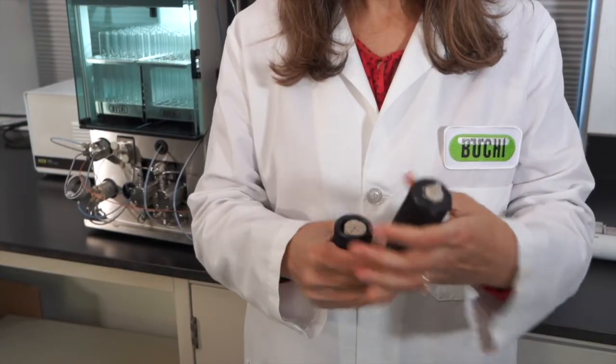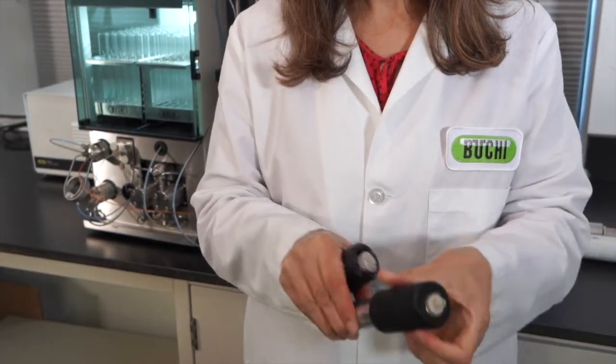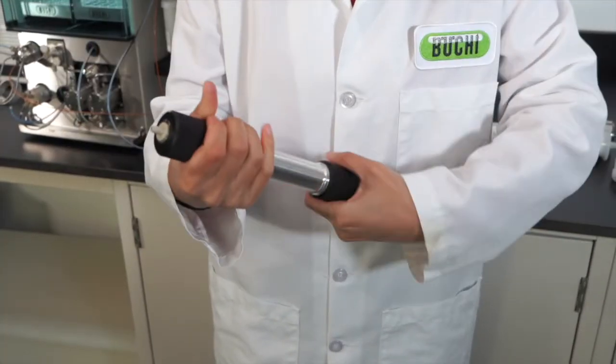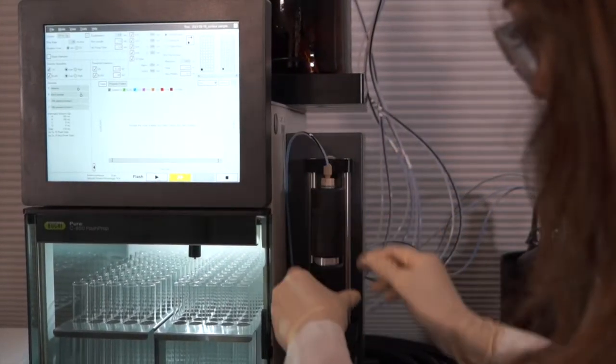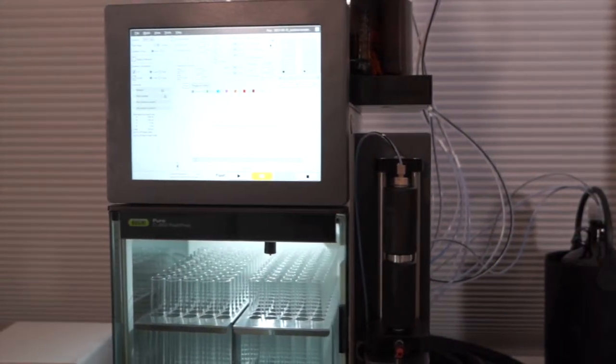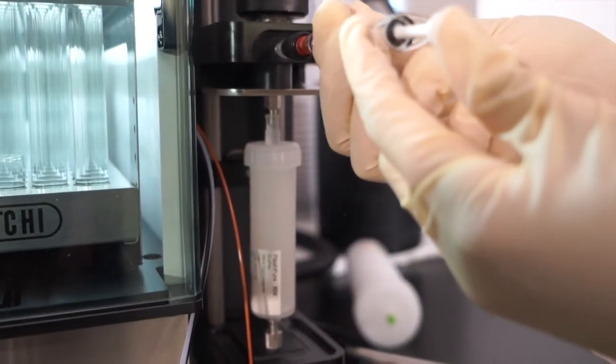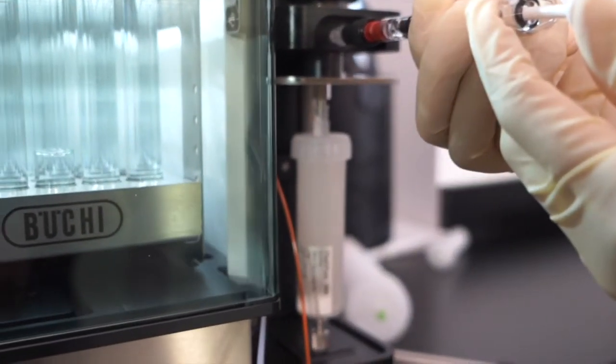For solid loading, I will use the solid loader with this pre-made sample provided by Switzerland, which is an adsorbent of silica and contains three compounds, cholesterol acetate, methylparaben, and 4-aminobenzoic acid. If I were to select liquid loading, I would inject my dissolved sample in this one-way injection port.